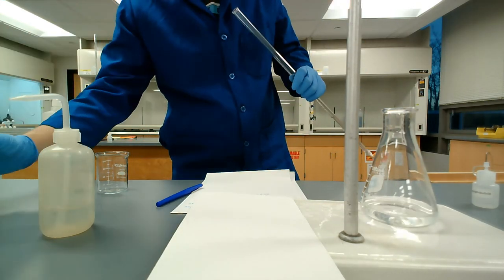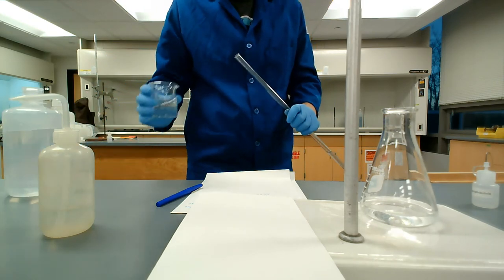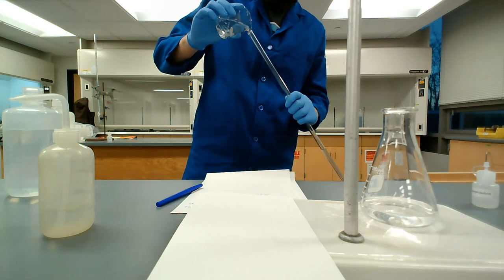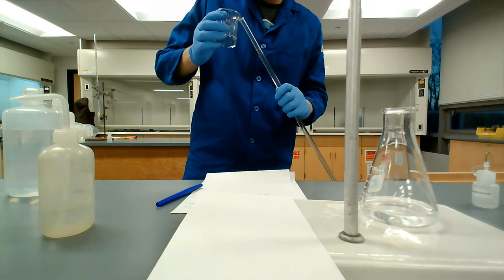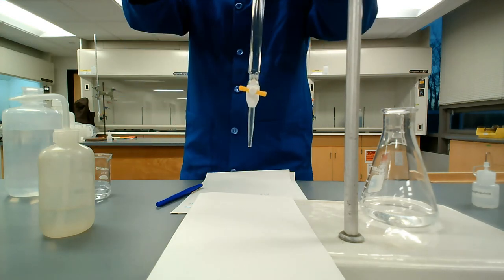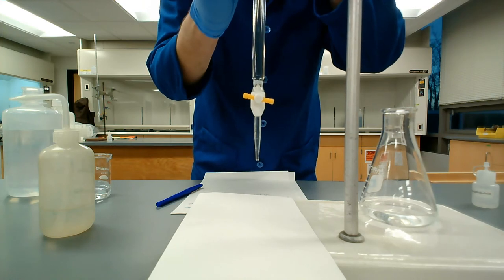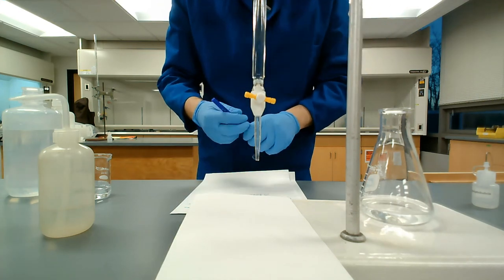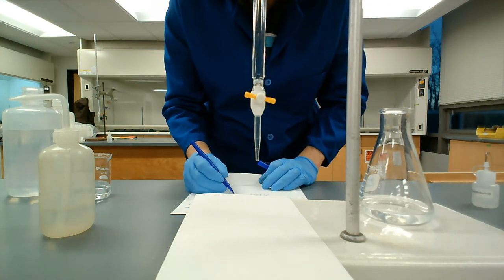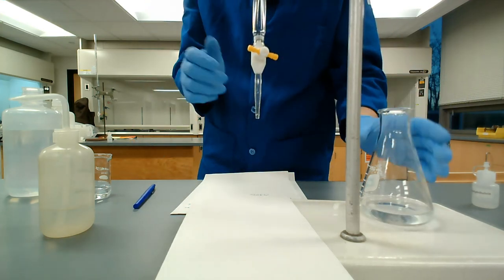I think I said this in the video earlier, but you'll also notice in the titration that both of my hands are involved. One hand is doing all the stirring, the other hand is adjusting the stopcock. That allows me, if I see a quick change of color, to quickly close the Buret before adding any more chemical. Whereas if I'm doing everything with one hand, I have to set the thing down and take my hand up and close the Buret. And by that point in time, another drop or two might have landed in my solution, and I very well may have overshot the endpoint of the titration where we see that color, right?